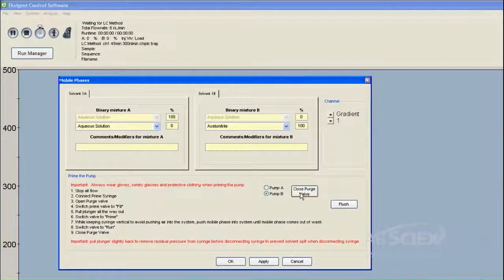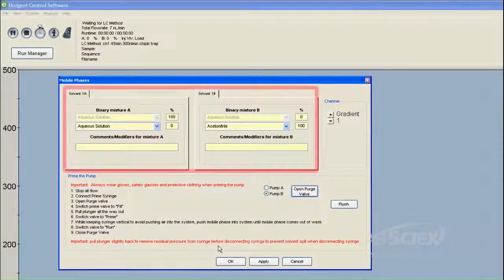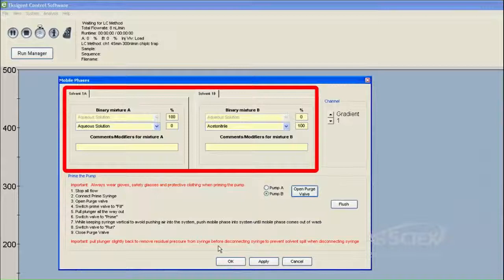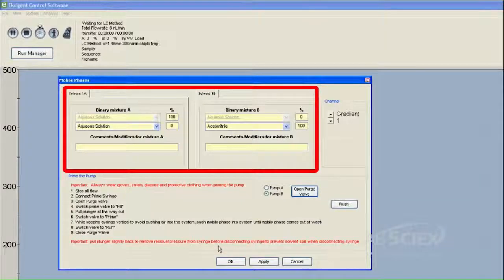Click the Close Purge Valve button. Verify that the mobile phases defined in the binary mixture sections are correct and match the solvent in the bottle. If necessary, change the mobile phases using the drop-down menus.